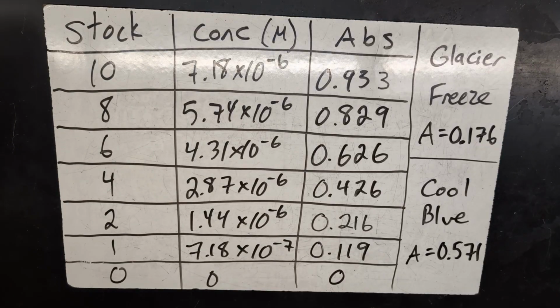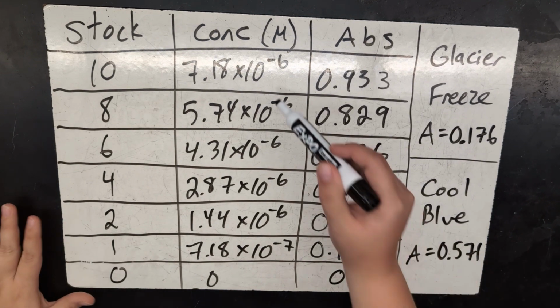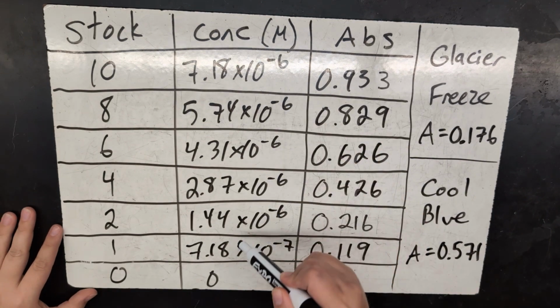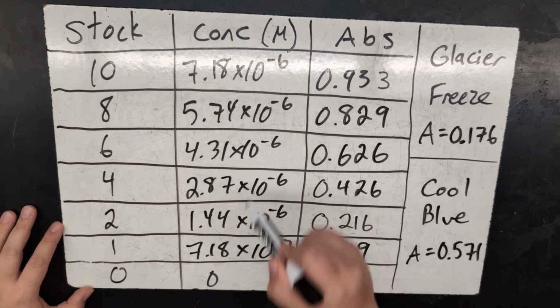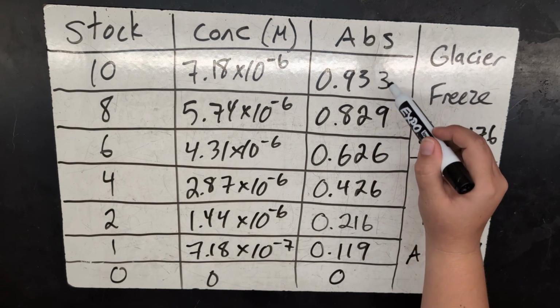So here are the final results from this lab. We have the concentrations that we calculated using the dilution equation. And then each cuvette was placed in the spectrophotometer and we recorded the absorbance.